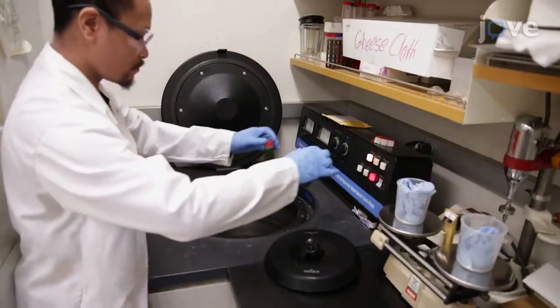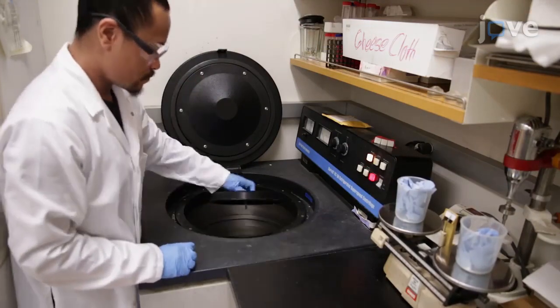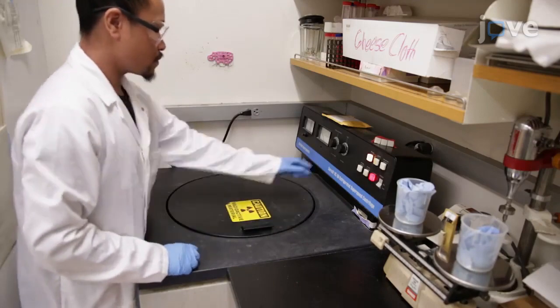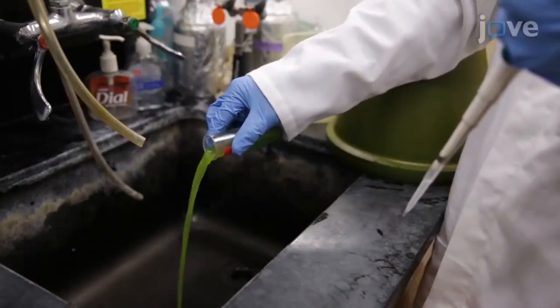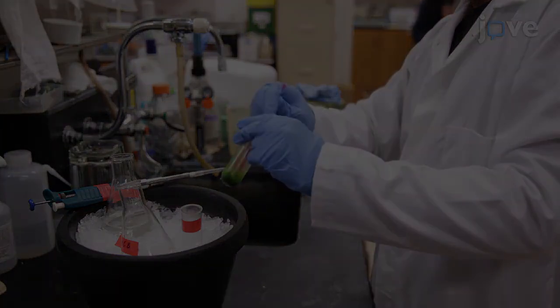Centrifuge the filtrate using a 50 milliliter polycarbonate centrifuge tube in a swinging bucket rotor at 3000 Gs for 5 minutes at 4 degrees Celsius. Discard the supernatant and use a paintbrush to gently resuspend the pellet in 1 milliliter of 1x.